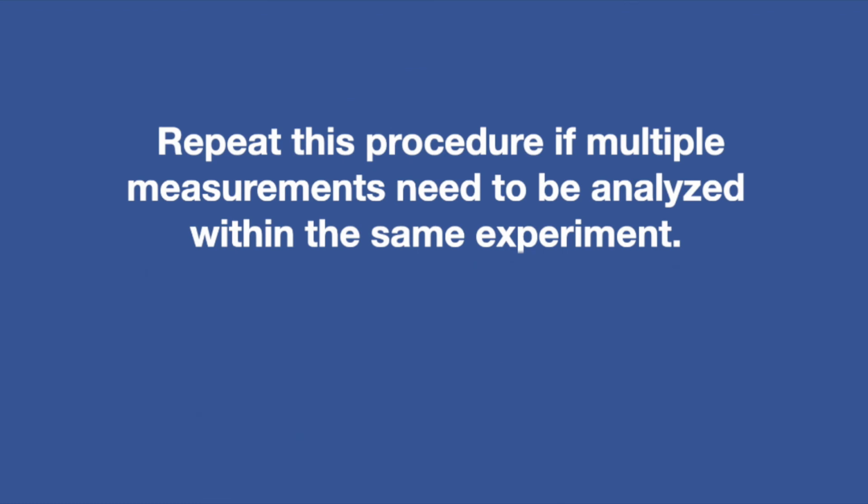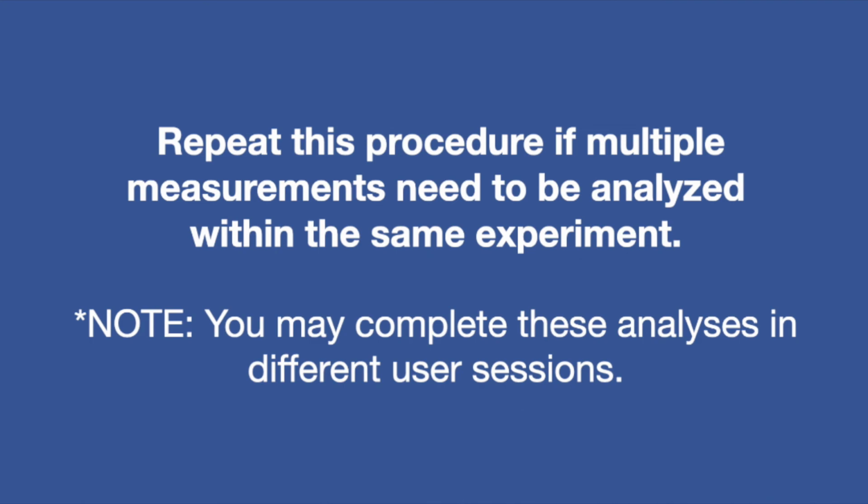Repeat this procedure if multiple measurements need to be analyzed within the same experiment. Note: you may complete these analyses in different user sessions.